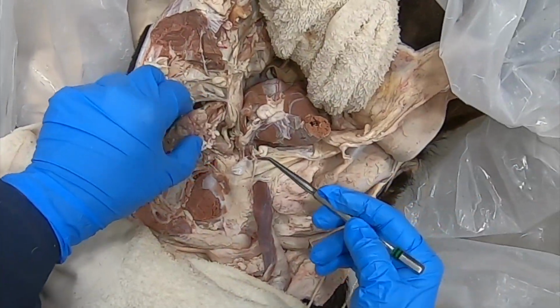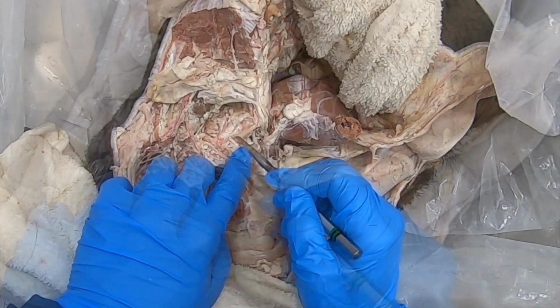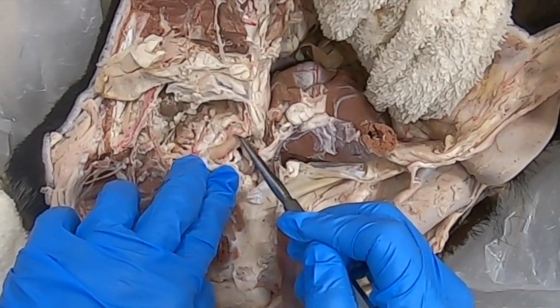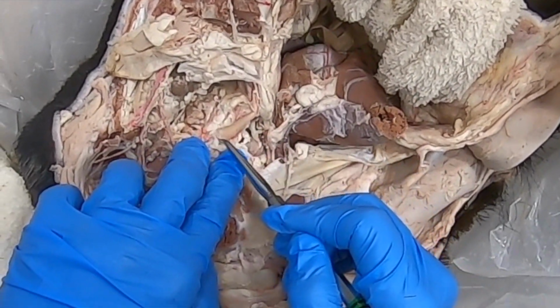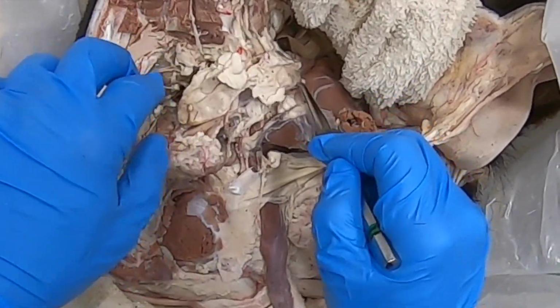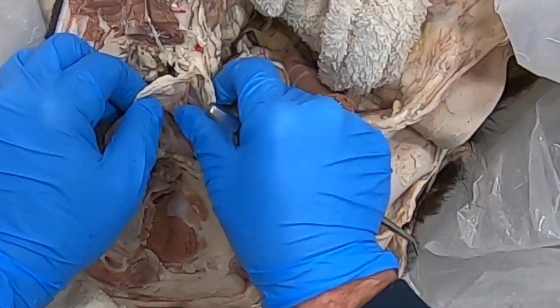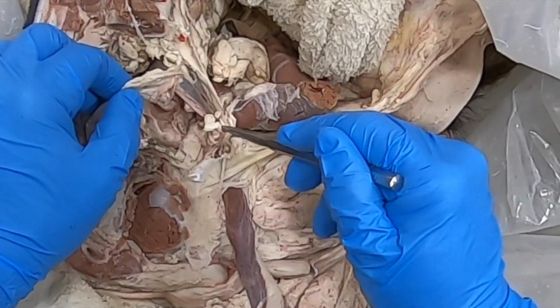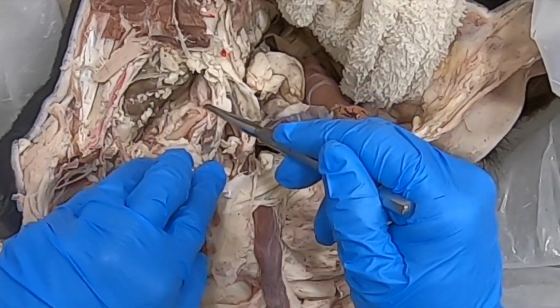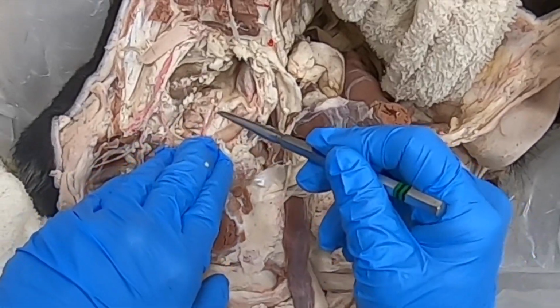So I want to show you here once again. We can see the accessory genital glands in the male goat. We can see a very nice dilation here of the Ductus Deferens. Okay, so here we can see that Ductus Deferens coming from here, coming back up, and this dilation is known as the ampulla of the Ductus Deferens.